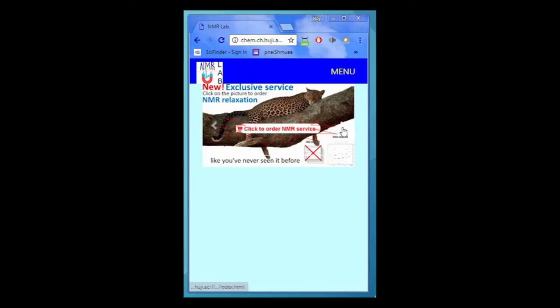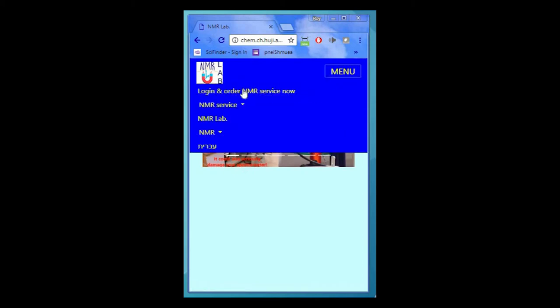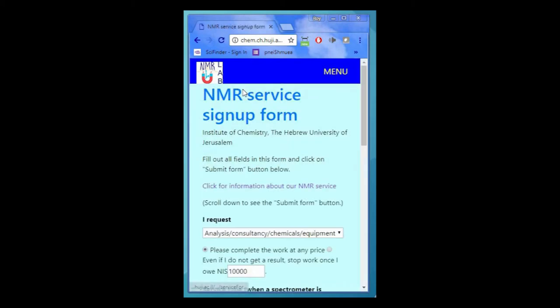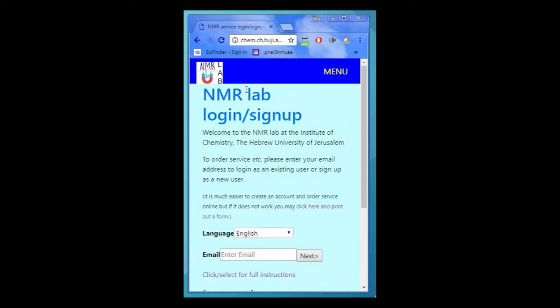If you are using a mobile device, press menu on the top bar and then press on 'Login and Order NMR Service' and you will be directed to the login signup page as before.